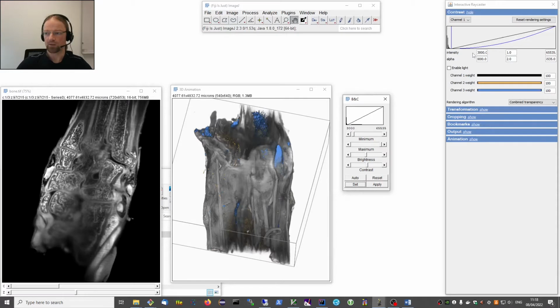Okay, so you can see we have this minimum and maximum as we have it in ImageJ, which basically means we define our black point and we define our white point, basically a translation from signal intensity to brightness. And in ImageJ there's a linear relation in between, so if we have an intensity which is somewhere in the middle, we'll get a gray value from linear interpolating between the extreme values. In 3Dscript there's another value here, which is a so-called gamma value.